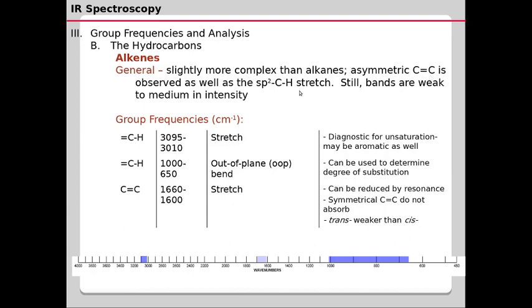in terms of finding out the molecular structure. In addition, in alkenes we have an sp2 hybridized carbon. So the hydrogen connected to the sp2 hybridized carbon, this C-H bond stretching, will usually give us a quite distinguishable IR peak. So that will tell us information about the alkene's molecular structure.